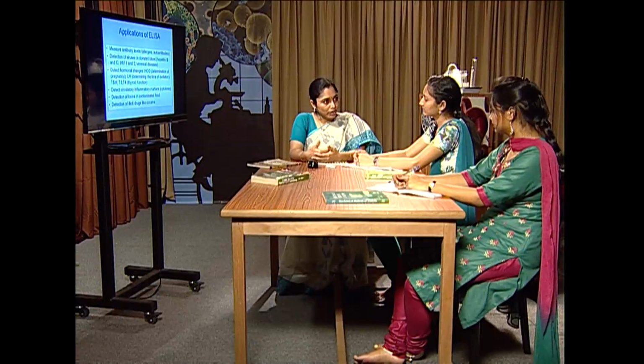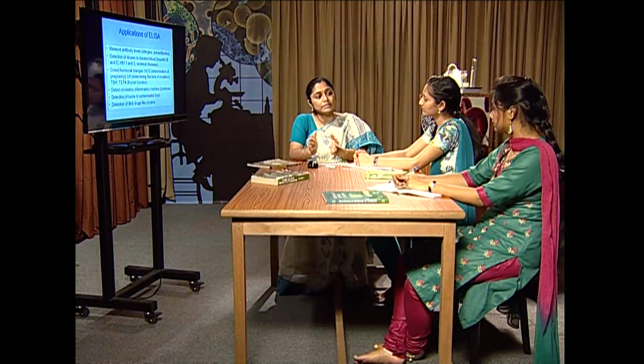So today we learned the immunoassay technique, enzyme linked immunosorbent assay. What is the basic principle of this technique? How does it work? What are the different types of ELISA? We know now that there are 5 different types of ELISA, and the advantages and disadvantages of each type of ELISA and its applications.